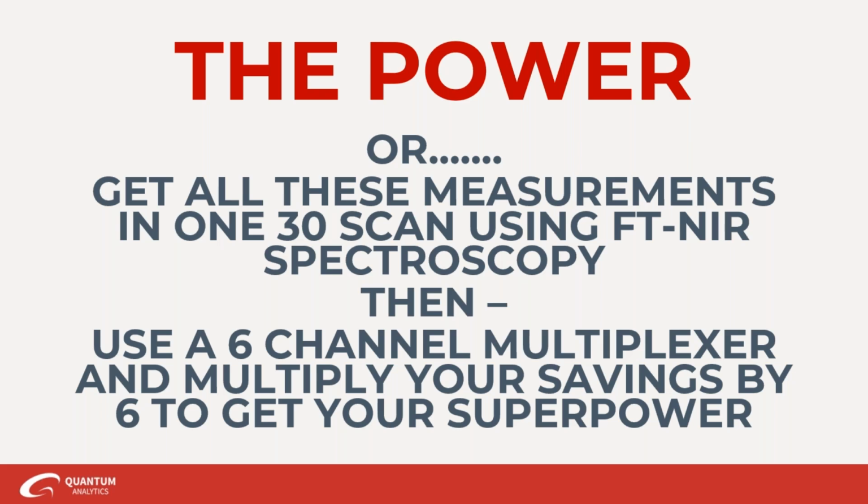So you can validate these models, but continue to build on them at the same time. It's important to look and see, is anything changing in your process? The temperature can have effects on the infrared spectra. So, if you're in a place where it gets really hot in the summer and really cold in the winter, and that's affecting your samples, that's something you've got to take a look at.